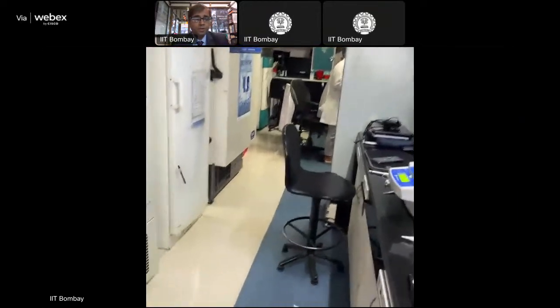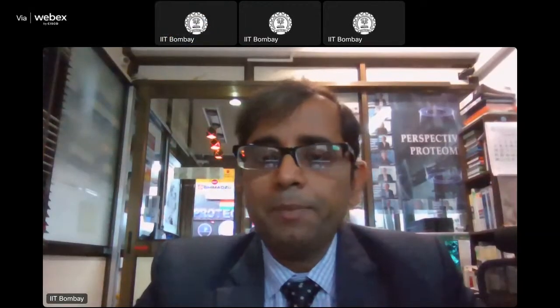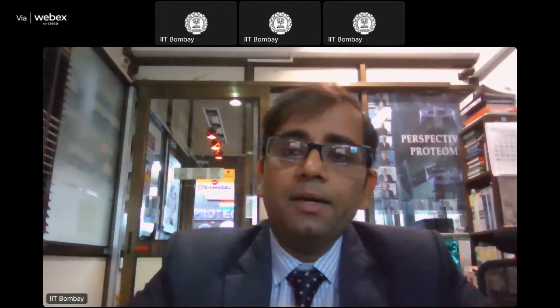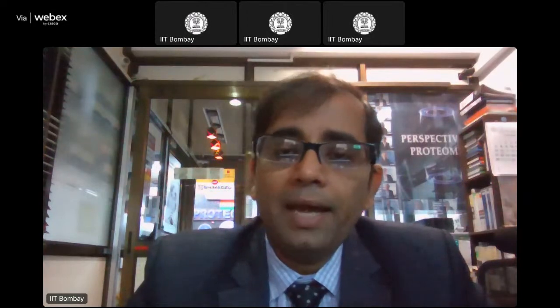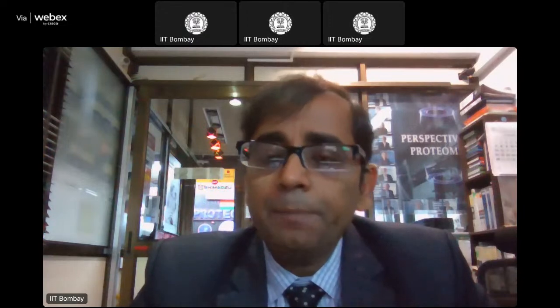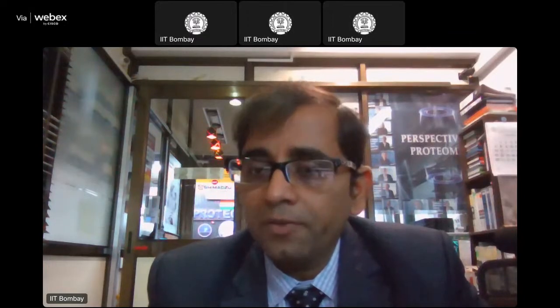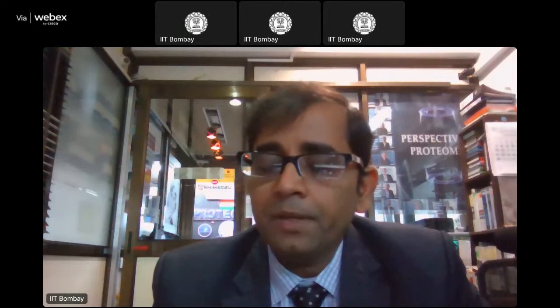All right. Thank you very much, Shashwati, Medha, and TS for showing the sample prep and the different steps involved. As students, you have seen that what we are trying to show you is the very basic workflow and very simple ways of doing proteomics. Sample prep could involve different ways of processing, but we showed you one of the ways. You can always come up with newer ways of sample preparation.